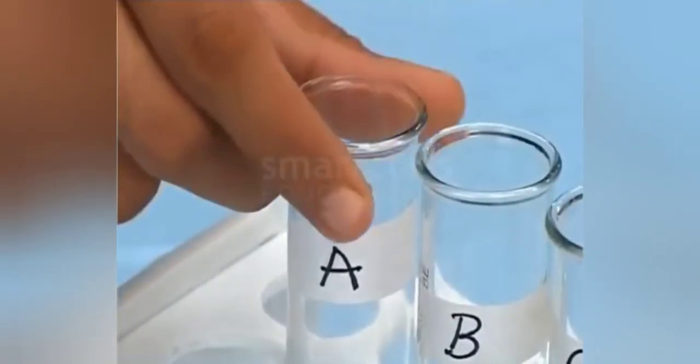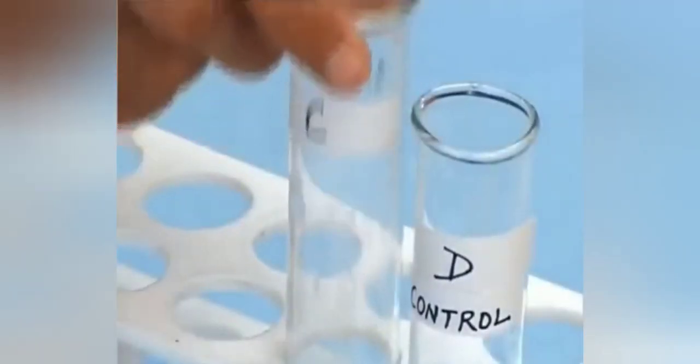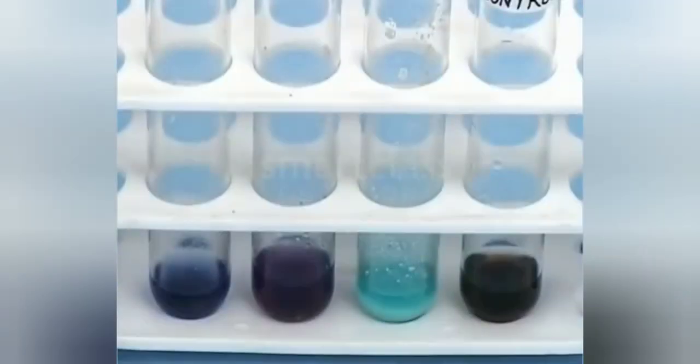Again, shake all the test tubes well. And wait for a few minutes. Observe the change in color in all the test tubes.